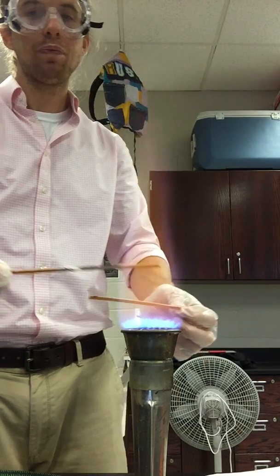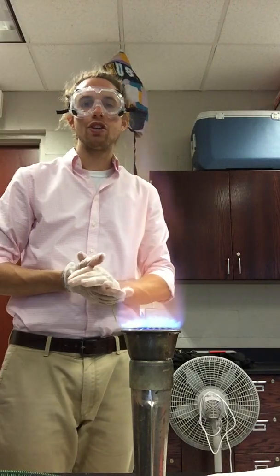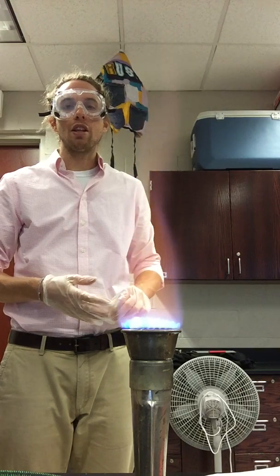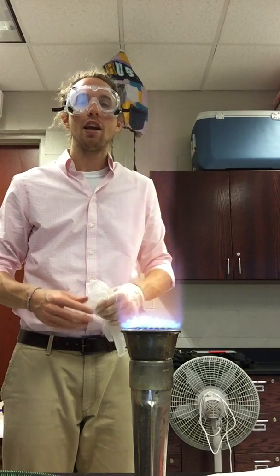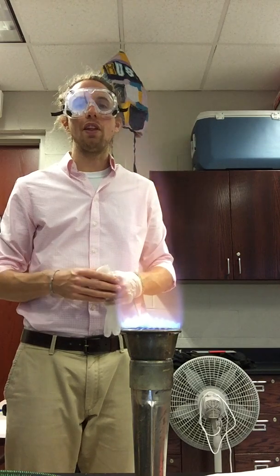With that in mind, you can do some calculations to figure out what sort of energy is involved in each one of those different samples that we used based on the color that we saw, because remember, color relates to wavelength, relates to frequency, relates to energy through some of the equations that we've been seeing in class. So you can begin that number crunching and then proceed with the write-up of the lab after that.